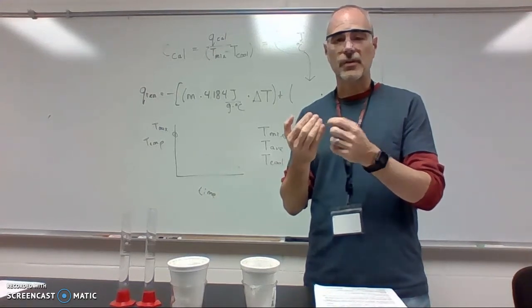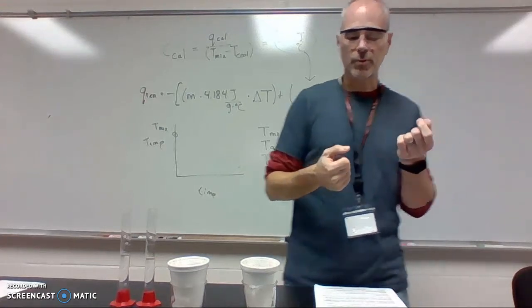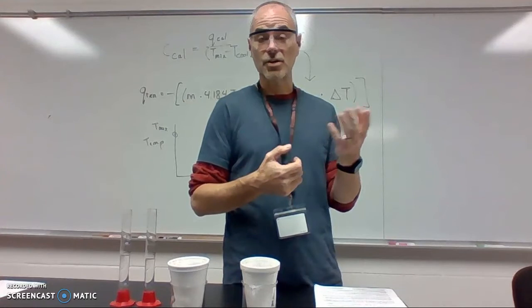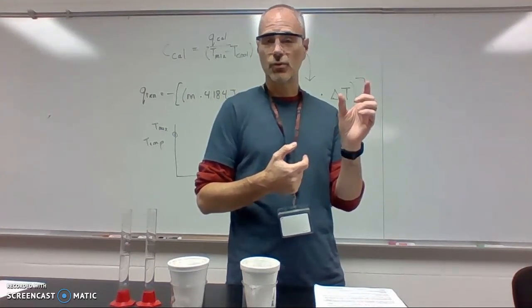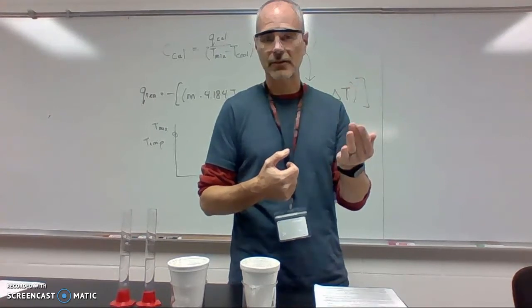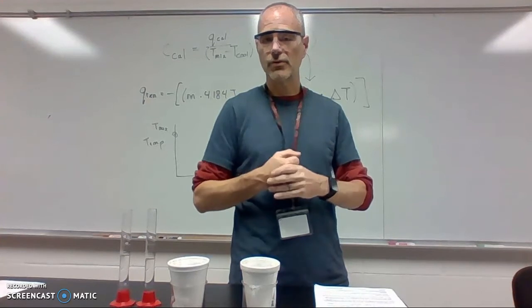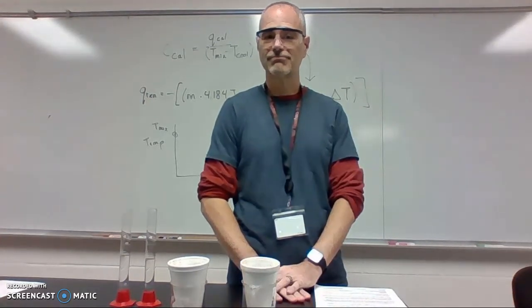If it's different, then that is your percent difference. So again, to explain this again, you actually ran experiment 3, and you got a value for it. So you actually have it. You can use equations 1 and 2 to theoretically get reaction 3. So it's a comparison of those two to generate a percent error. There you have it.